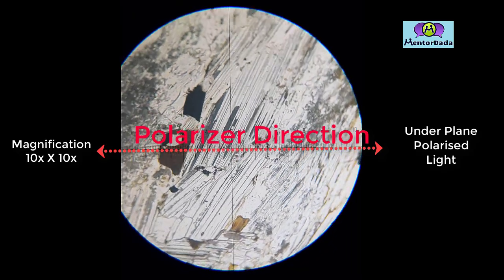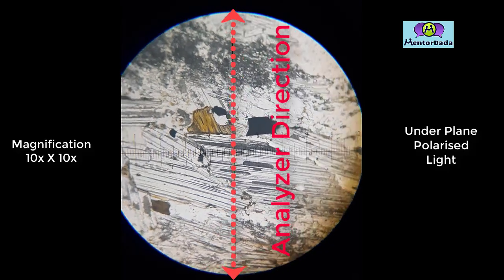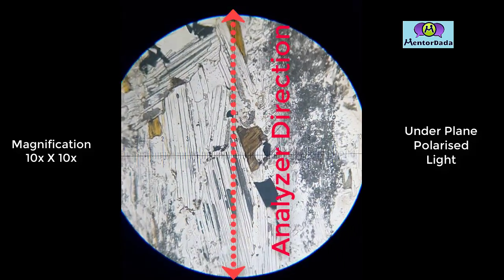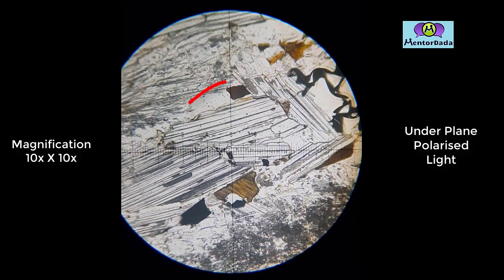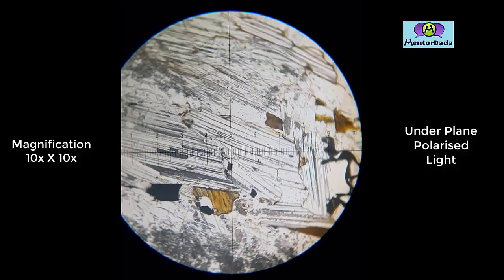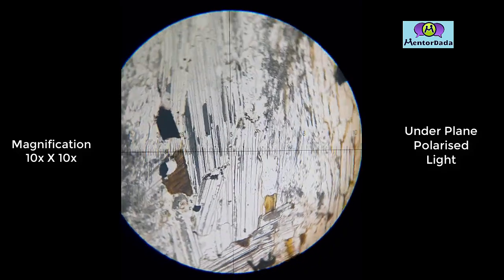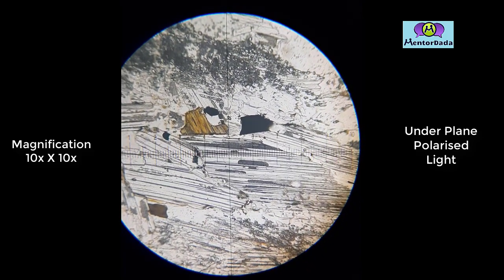This is another mineral under plane polarized light. Here the mineral is showing non-pleochroic property. As we are rotating the stage, the color of the mineral is not changing, so the mineral is non-pleochroic.